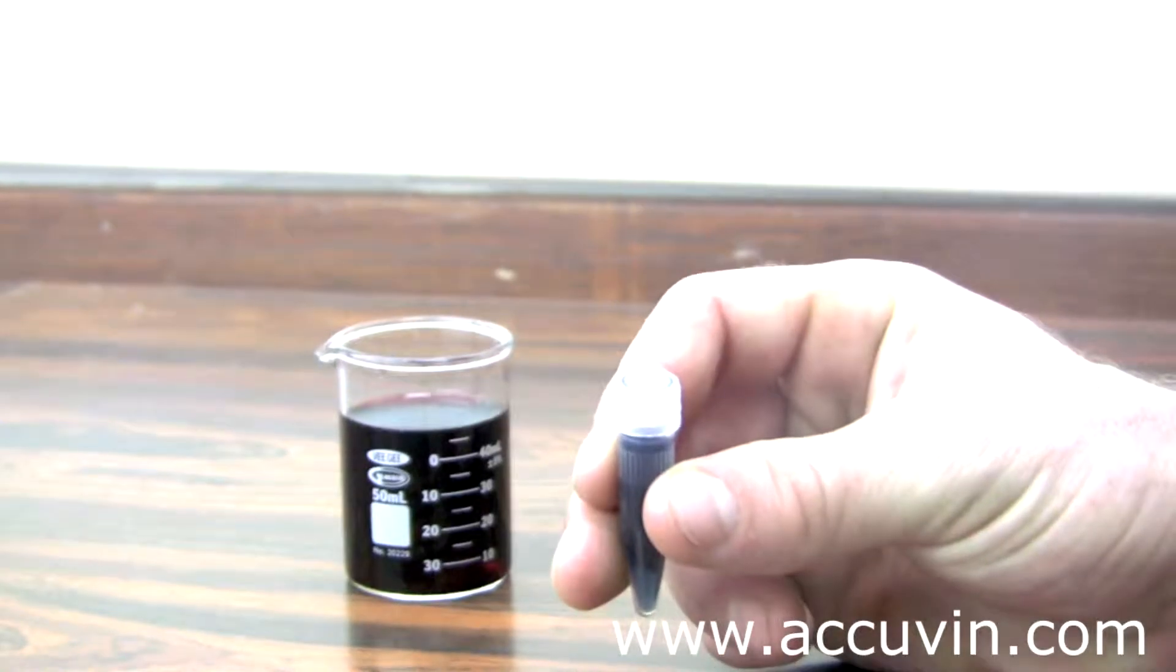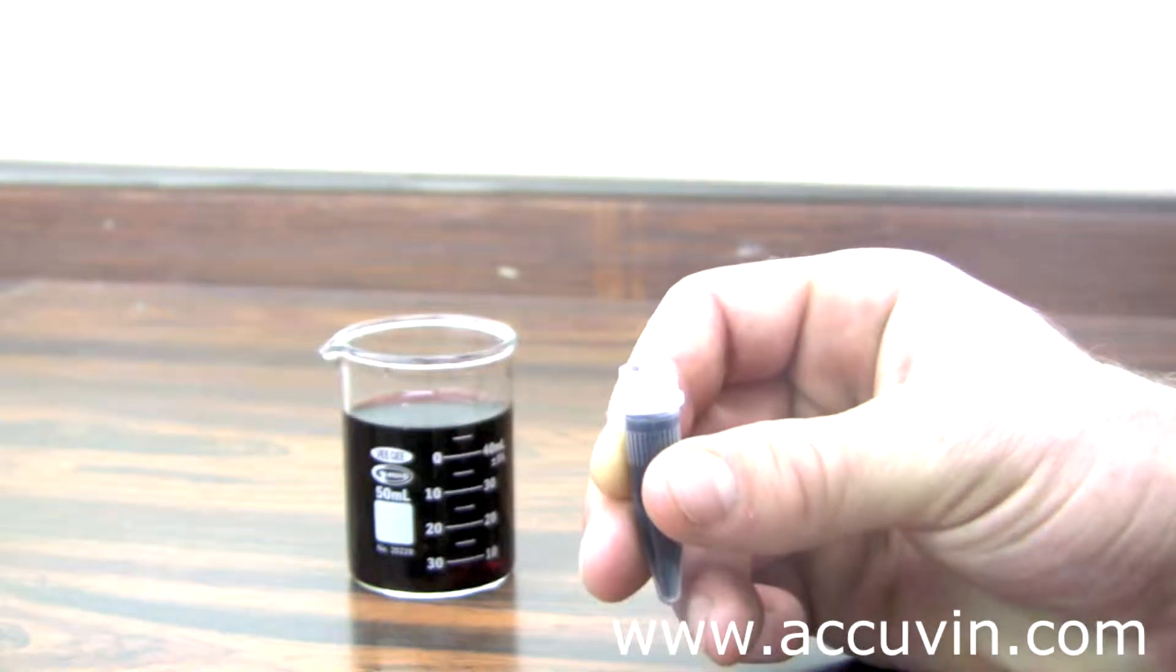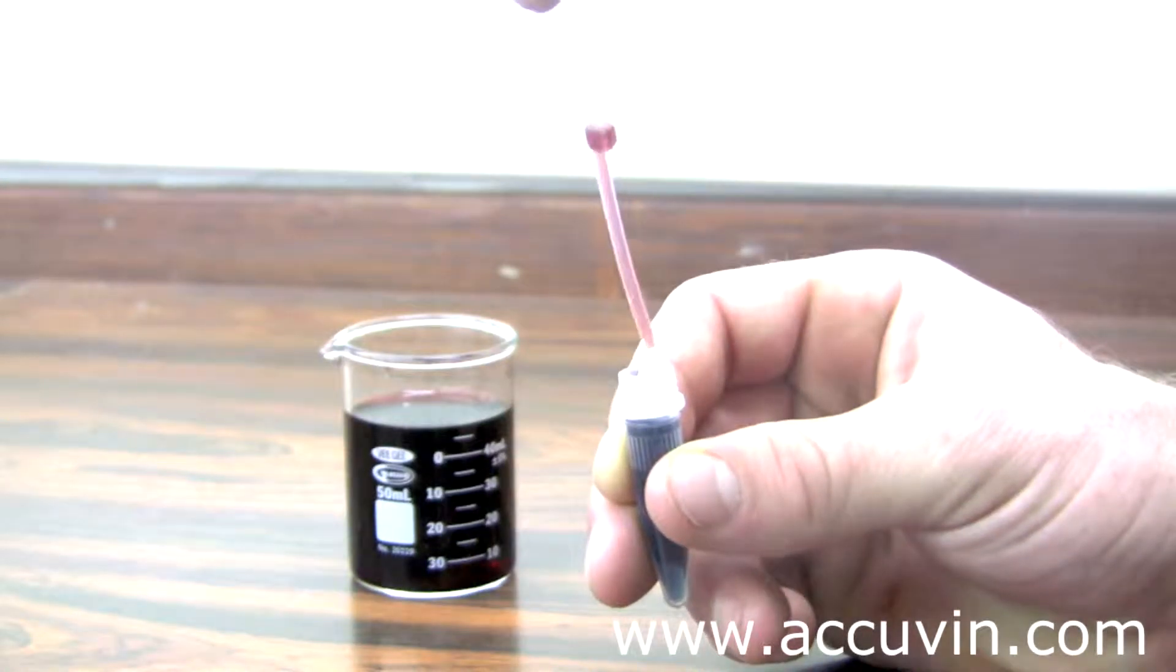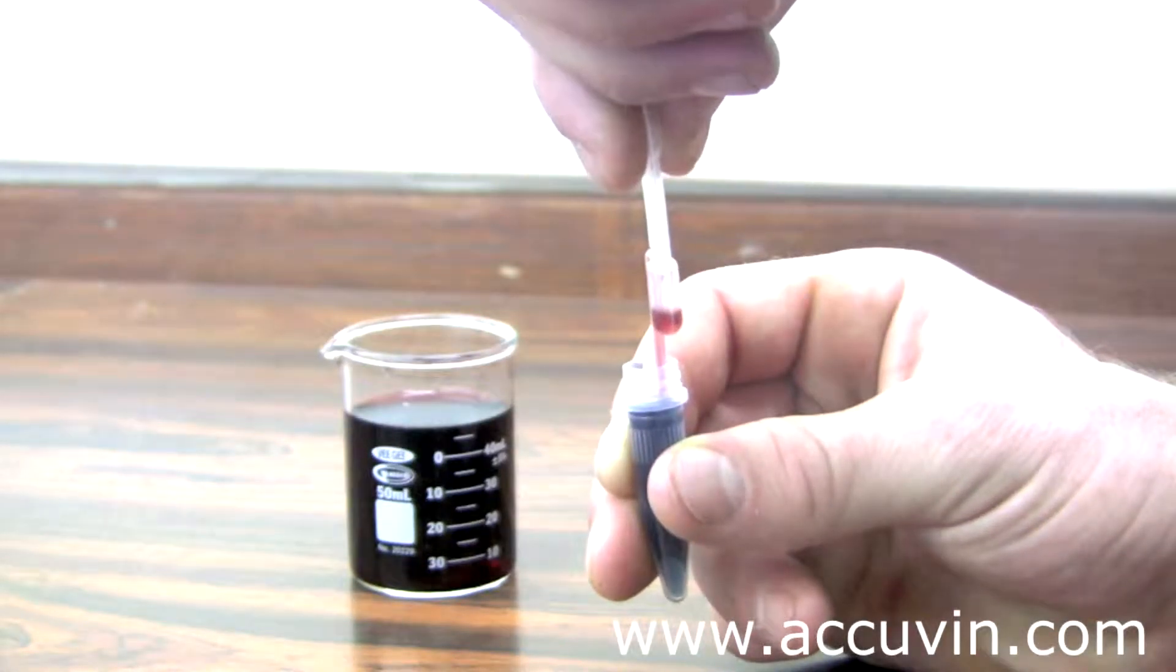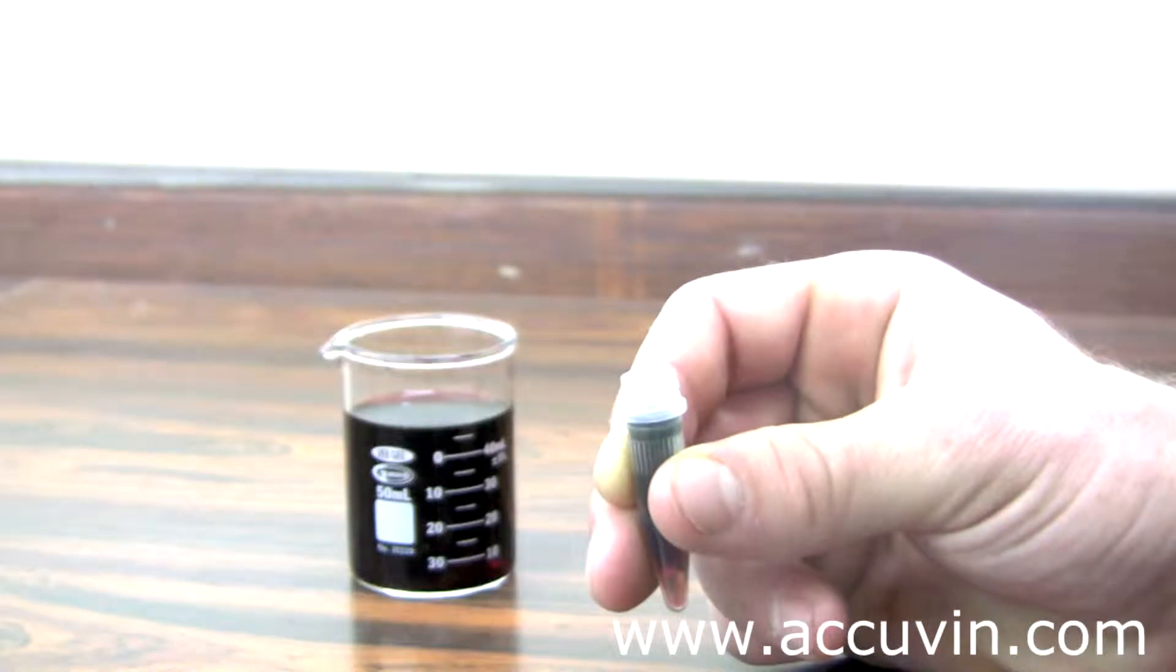Next, take your reagent tube and remove the cap. Then take your sampler and put the tip of your sampler into the tube and press the fill bulb. While still holding the fill bulb, pull the sampler out and release.